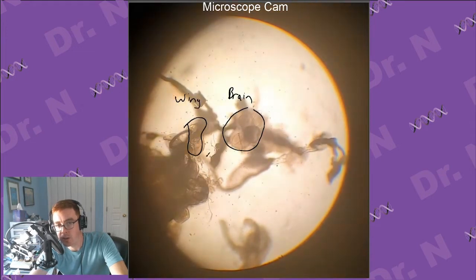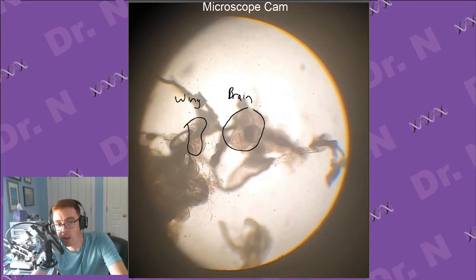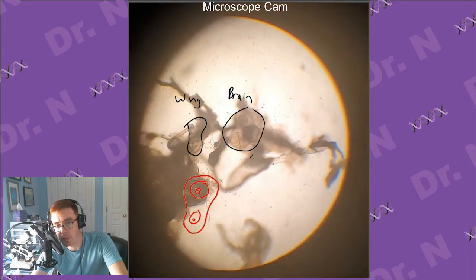In the larvae are sacs of cells that eventually become the pieces of the full adult fly. So the wing disc kind of looks a little bit like this. It's got some swirly bits in it. And that eventually becomes the wing.